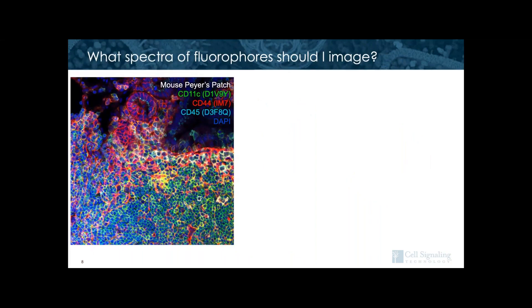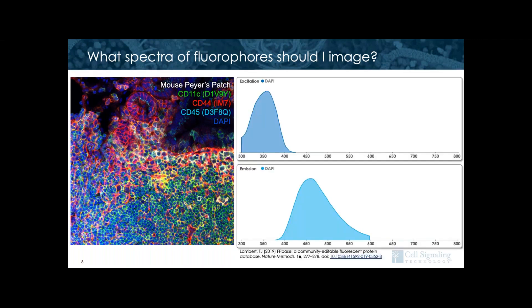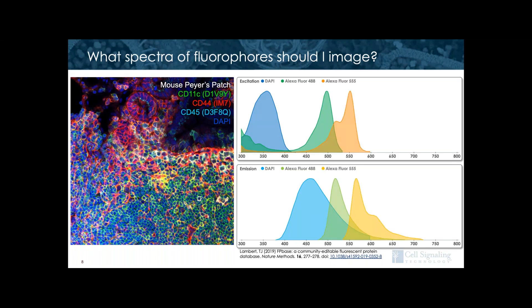So what fluorophores should you use in your experiment? I wanted to give you some standard examples. Here I'm showing our spectra of choice for a four-color image. I've used DAPI — a nuclear dye excited around 350 nanometers with peak emission around 450 — as well as Alexa Fluor 488, Alexa Fluor 555, and Alexa Fluor 647. This is an image from our confocal microscope, and you can see from the curves on the right that this many dyes already has significant spectral overlap, which could make imaging challenging if any of the signals are too strong.